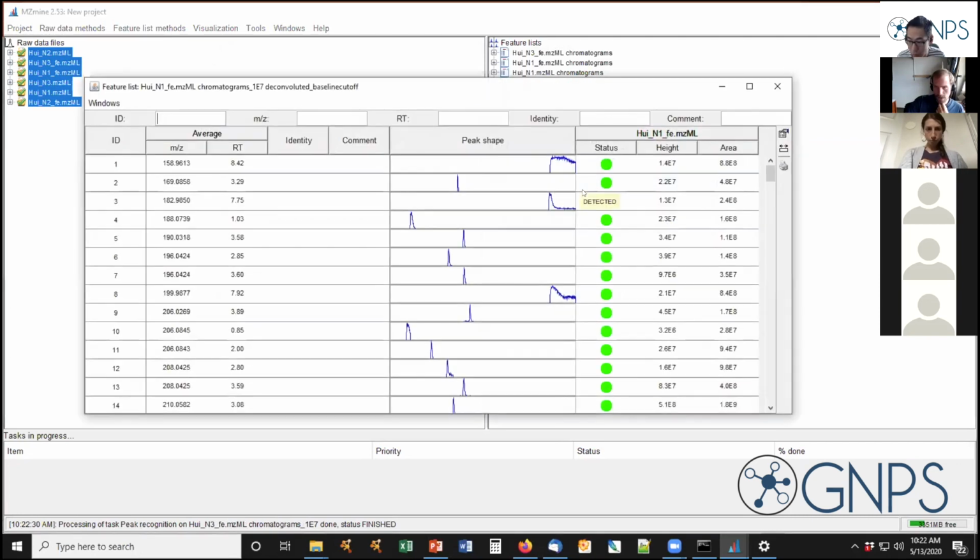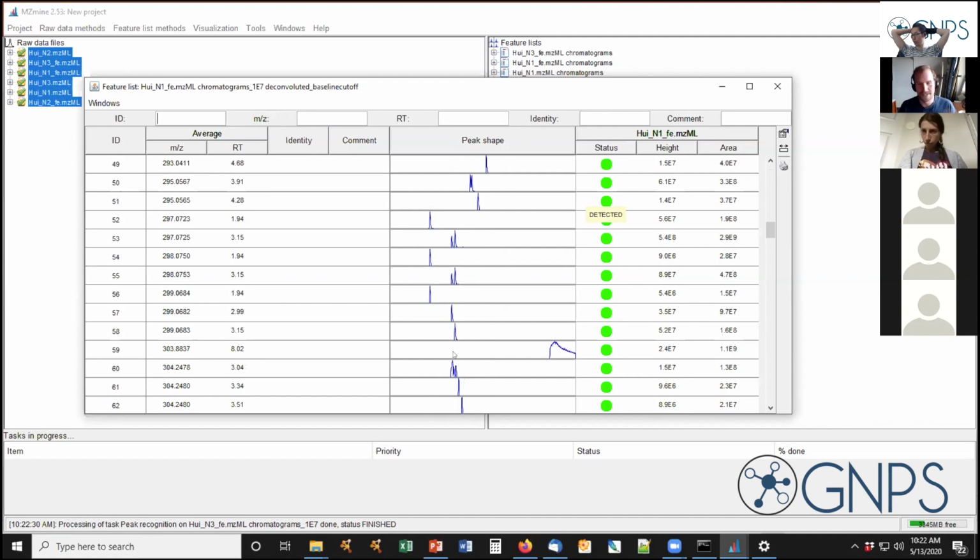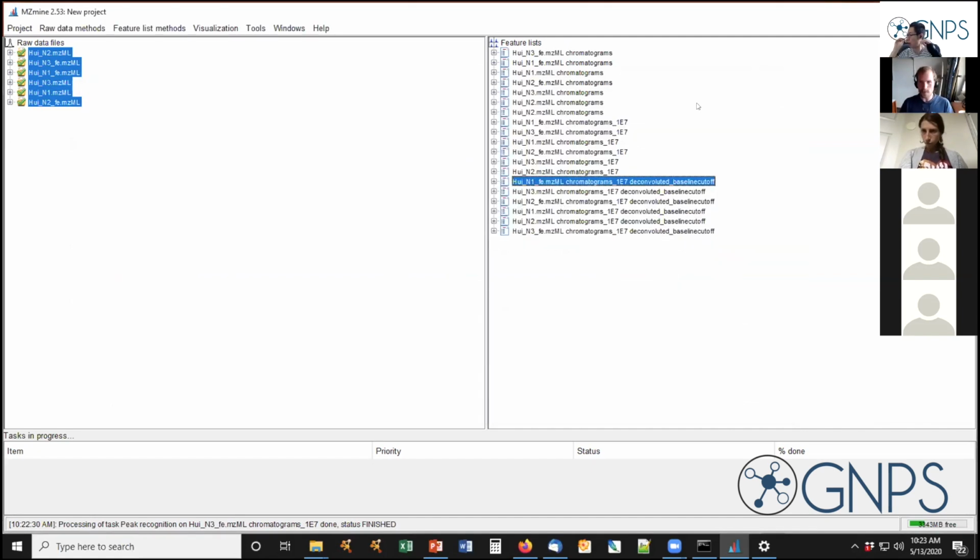And when I open one of those, I should now be able to see that hopefully most of the peak lists have only one peak. Yeah, there's some, exactly, like this one here, where the deconvolution failed. But we won't find a setting that is perfect for all molecules we have. So here it's really try to get it as good as you can, but don't expect that it's going to be perfect.